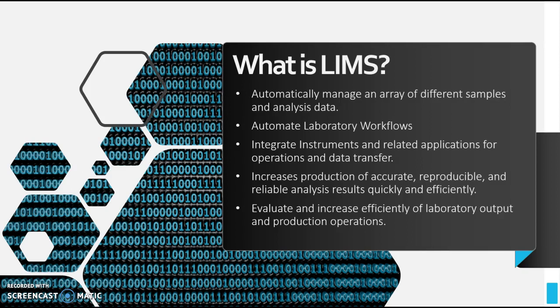LIMS software also assists technical professionals to produce accurate, reproducible, and reliable results quickly and efficiently by automatically implementing quality assurance practices. The data collected through LIMS can be used to evaluate and improve the operational efficiency of the lab and actually helps production operations as well.